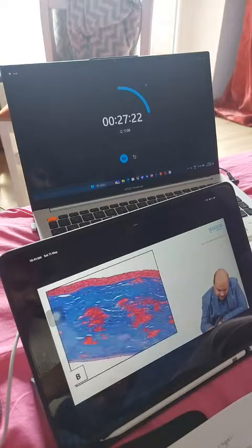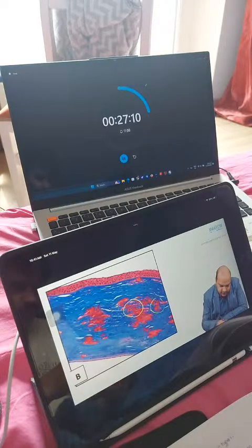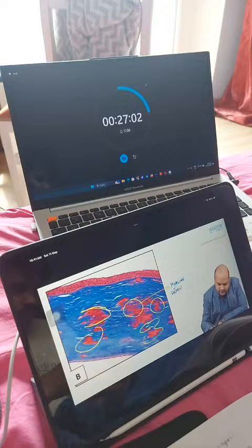Okay, let's see the image, everybody. So this is an image of Masson trichrome stain. What we can see, first of all, the epithelium with all the nuclei in it, all this collagen in blue color being stained. But within the stroma, where there is blue collagen, we are able to see these pinkish yellowish deposits everywhere. Everybody? So these are hyaline deposits. These are all hyaline deposits. I hope I'm clear. The stain is Masson trichrome, and the diagnosis becomes granular dystrophy.